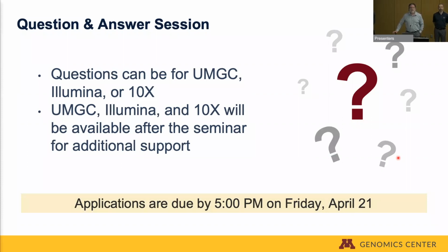For FFPE, you mentioned that you can do single cell. So the question is for FFPE, we can do single cell, but we need to submit scrolls. You probably don't need to submit scrolls. This is actually something that probably we need to talk through. So you need to prepare first. The first step is to prepare scrolls out of the FFPE blocks. And then with our protocols, you will dissociate the tissue and then isolate the cells from the tissues. Essentially, there is a deparaffinization step. At the end, you're gonna end up with a single cell suspension. This is what you're probably gonna submit to the core.